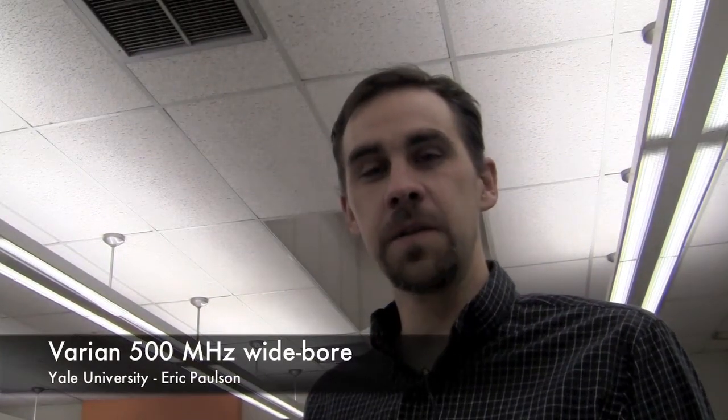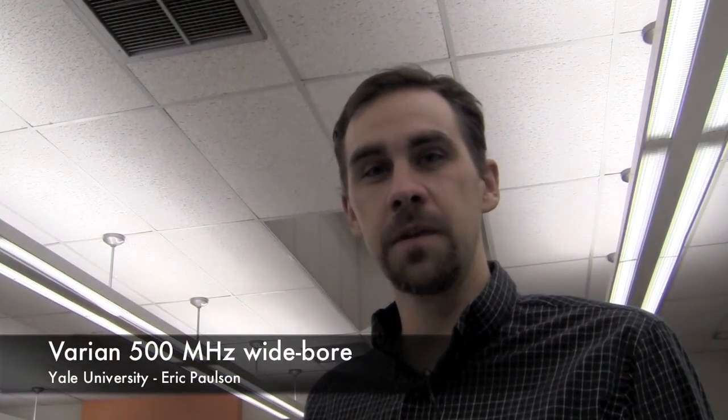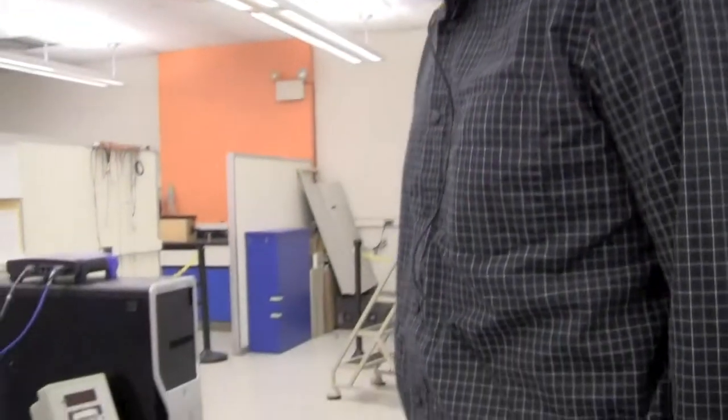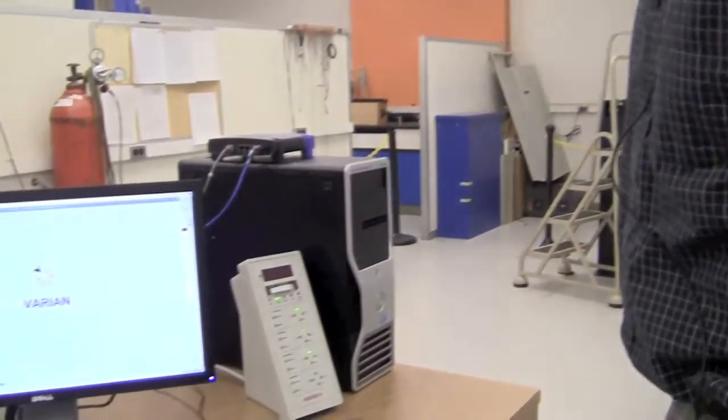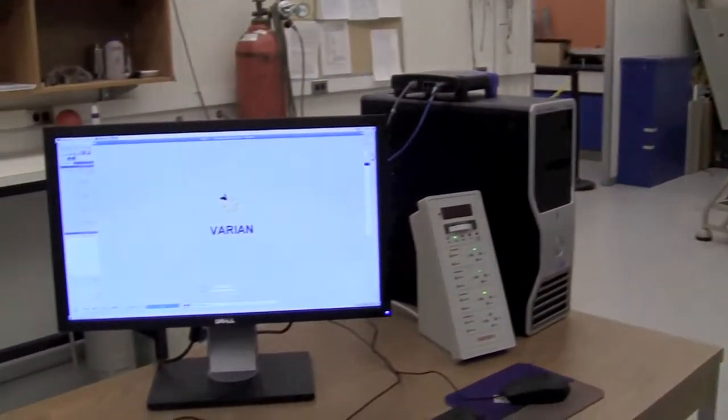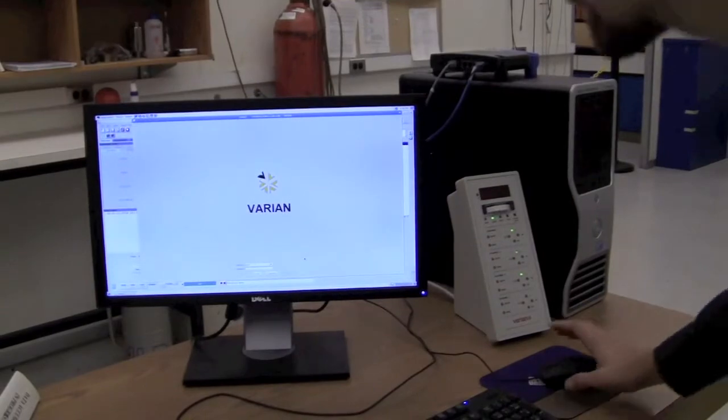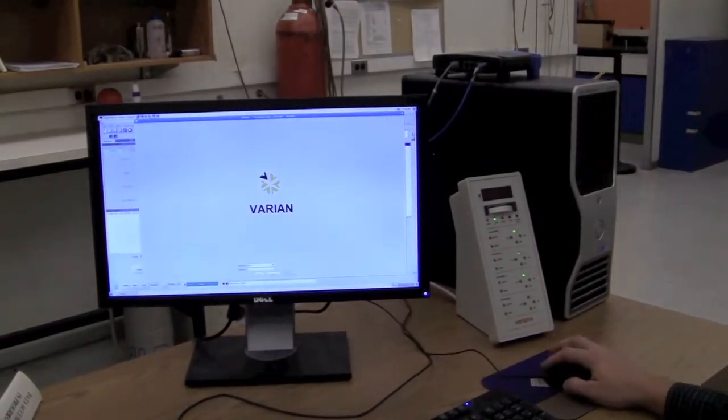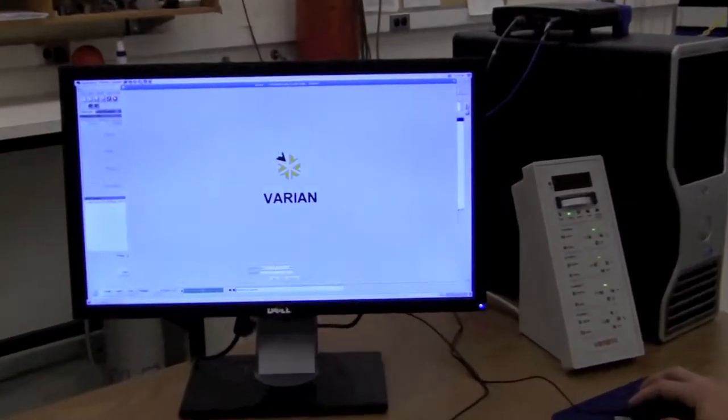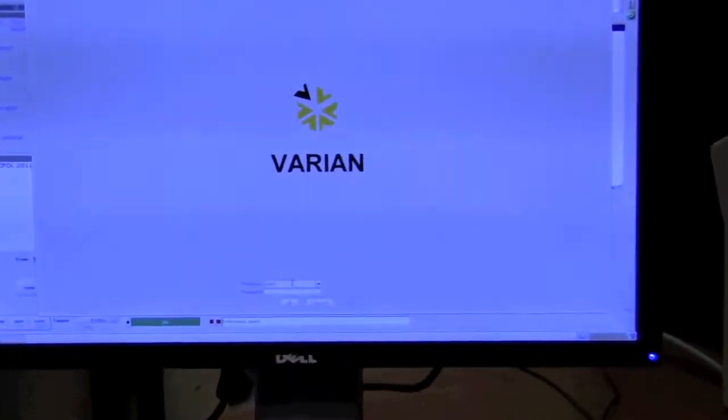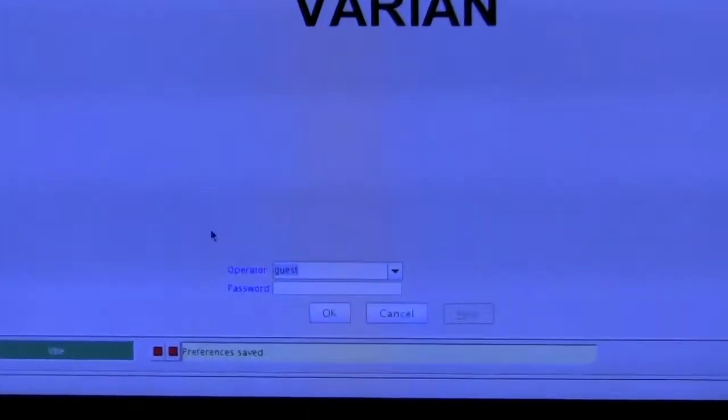This is a demonstration of how to use the Varian NMR spectrometer in walk-up mode. When you come to the instrument, it should have the operator login screen already open. You can log in with your normal NMR username and password.